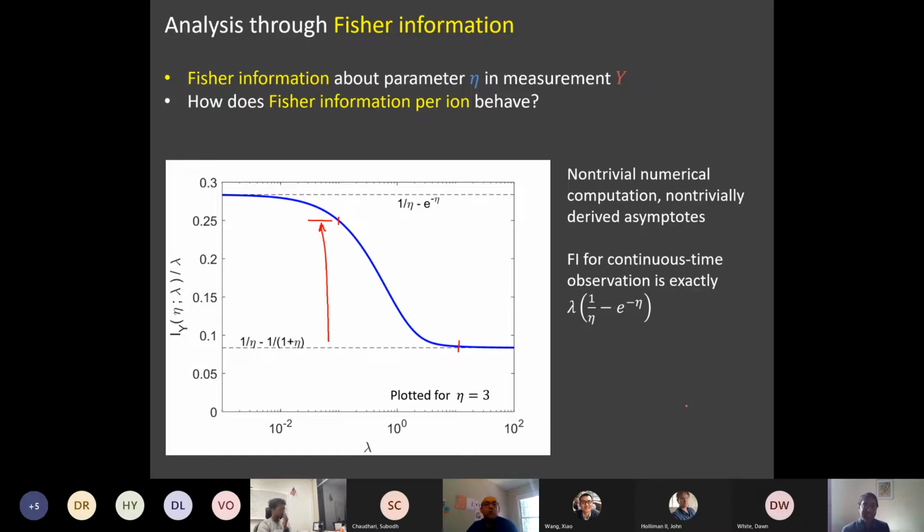So it's basically telling us that continuous time measurement is good because as I go to the left, I get more and more improvement. This graph is also telling us that there are diminishing returns in making the time resolution finer and finer. And that's reassuring as well. If it turned out that I needed extraordinarily fine time resolution to get any of the advantages that I'm claiming, well, then this would be less valuable. But it seems that if I keep the dose per sub-acquisition at 0.1, then for whatever total dose is appropriate based on how fragile my sample is, I'm getting most of the advantage of the continuous time or the time resolved sensing.